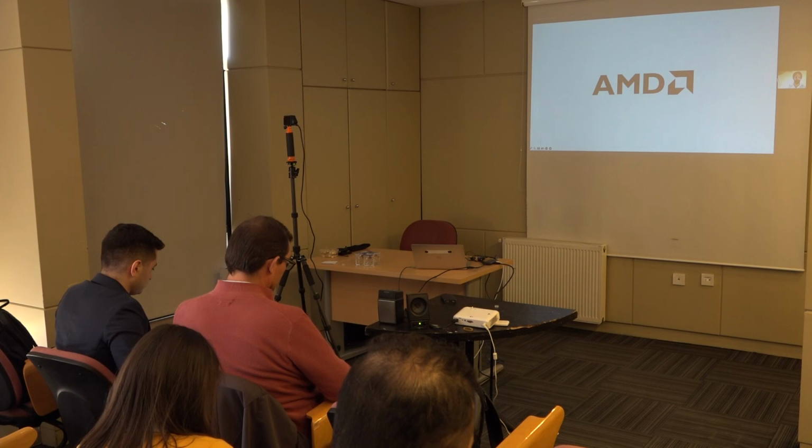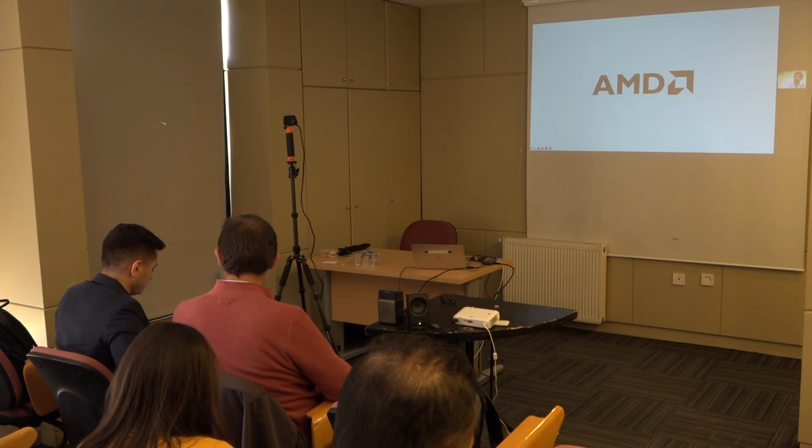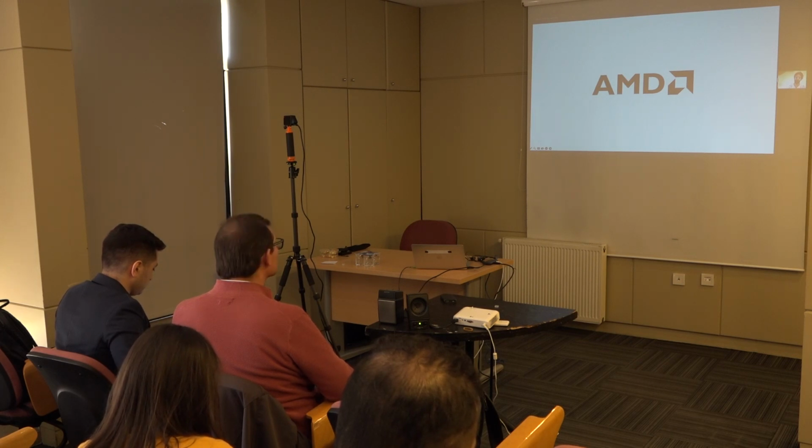And that's why with these two models we always get the same accuracy. The potential use case for this FP is that you can use it out of the box on any GPU. Because we are using a lot of these basecallers on GPU right now, we built one FP version, so you can run it on GPU.